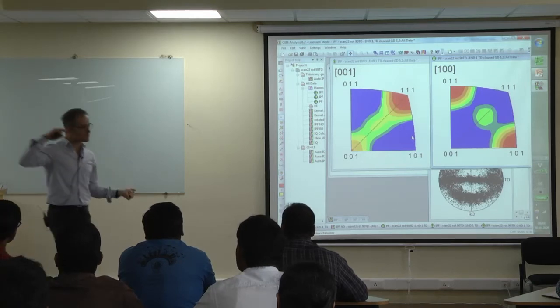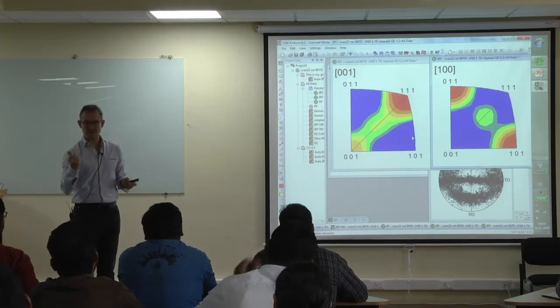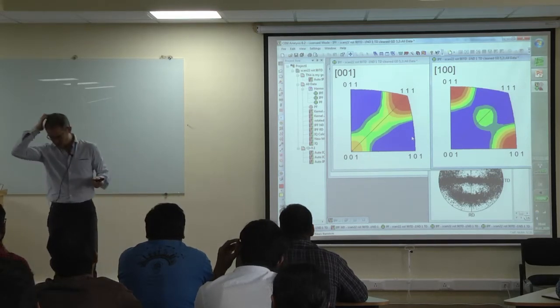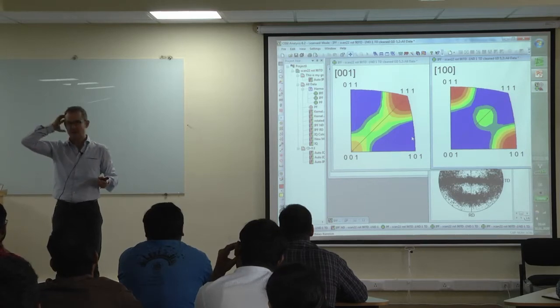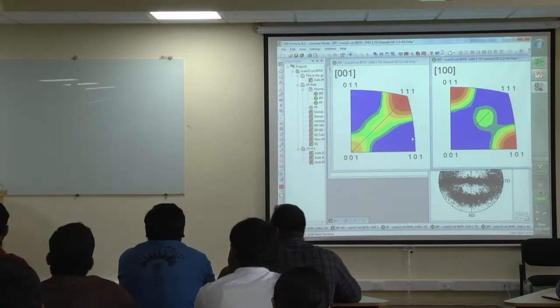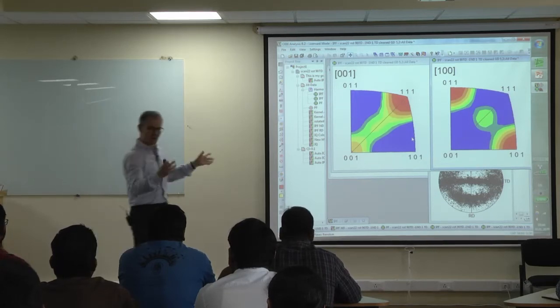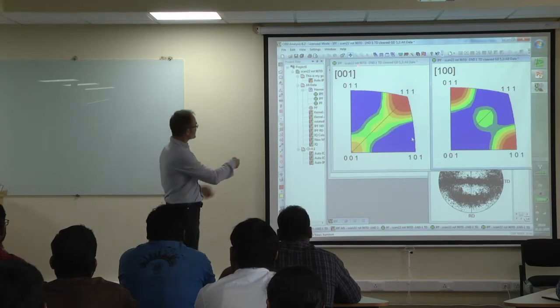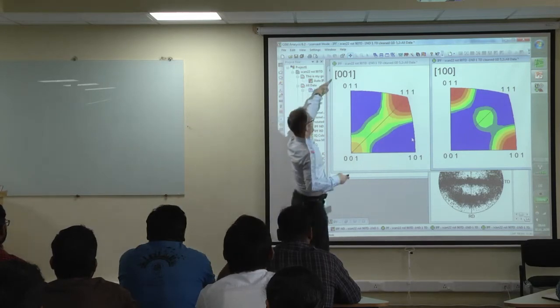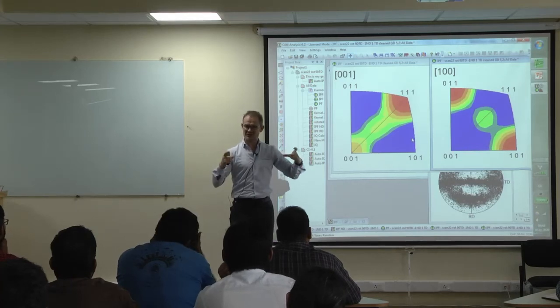You know, okay, my material has been rolled, it has been extruded, it has been, I don't know, we have done severe plastic deformation by ECAP, equal channel angular pressing. So you have done ECAP on the material and you want to understand how the sample reacts to that. So what is known to you is the sample direction. So I know I'm interested in this [001] sample direction. They write it here with square brackets, which usually indicates that we are talking about a crystallographic direction.